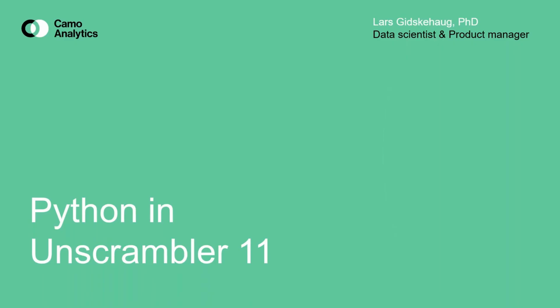So this webinar will be a light introduction to how to use Python from within Unscrambler. It will not go into details about the library that we use for doing that, no technical details about how to actually write the scripts, but rather an introduction to what can be done and where you should get the information you need to get started. I will go through some slides first, point you in the right direction for getting started, and then do a demo in the end.